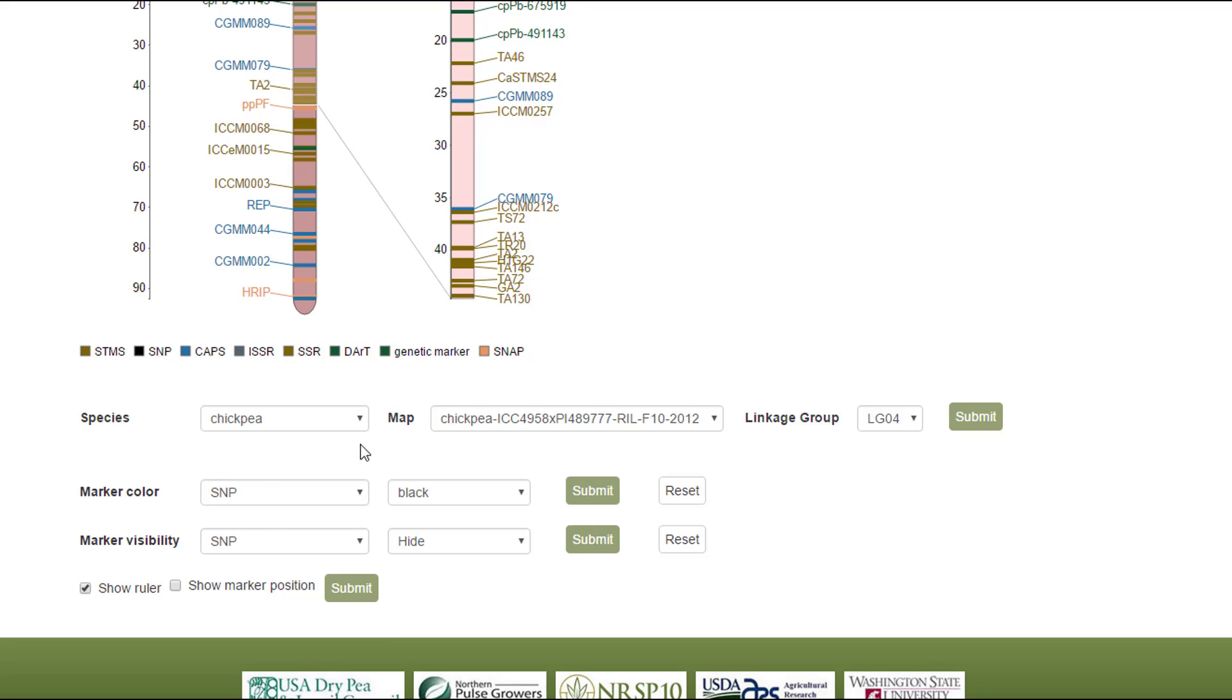We can also hide or show the ruler and also show the actual marker position.